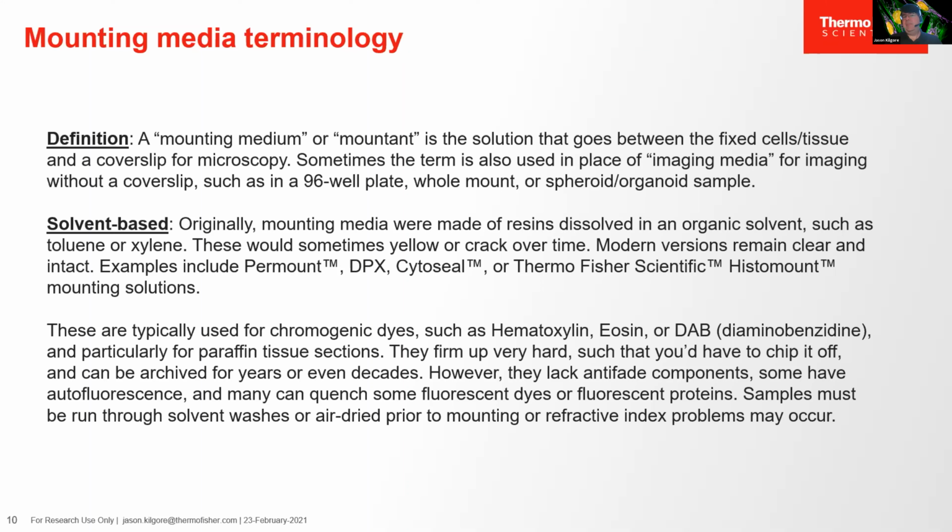But sometimes we can say mounting media to mean something that's not necessarily under a cover slip, but also what you would put in a 96 well plate for imaging on an inverted microscope, or that you would bathe a whole mount or spheroid in. Traditionally, the mounting media were solvent-based. If you go back 50 years or even 100 years, I think some of the original mountants were resins, sometimes even derived from tree resins originally, that were dissolved in toluene or xylene or other organic solvents, and the really old ones would yellow or crack.